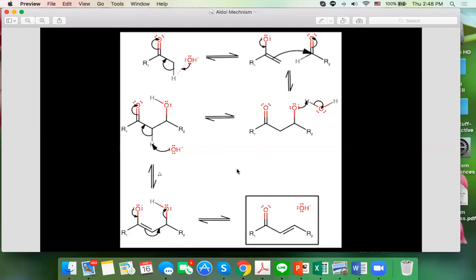If we use the reactant we selected, I can tell you there are so many scientists trying to modify the substituents on the ring, on the alkyl group, in order to stabilize the product. They play 1,000 tricks to enhance and maximize the yield, okay? All right.